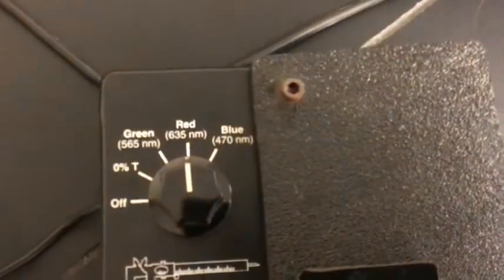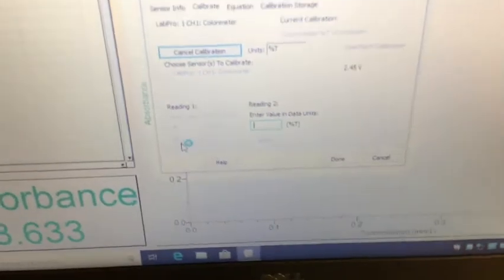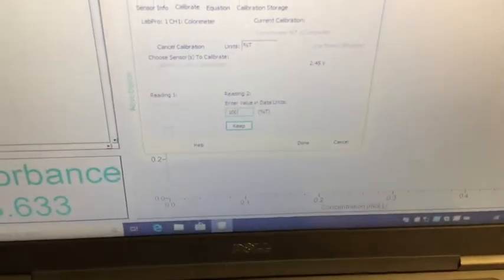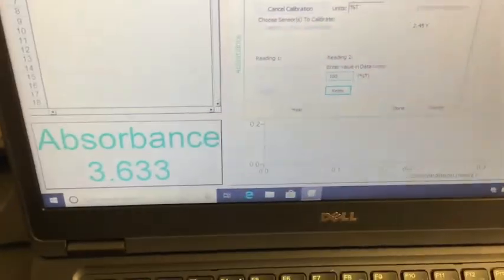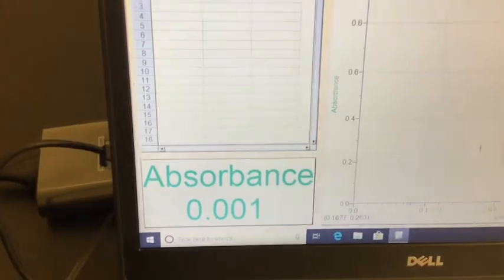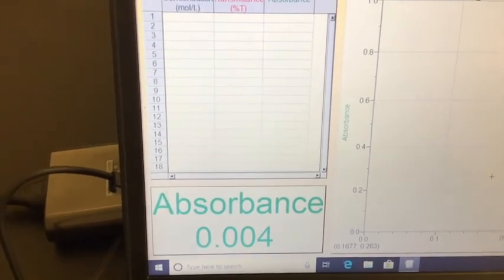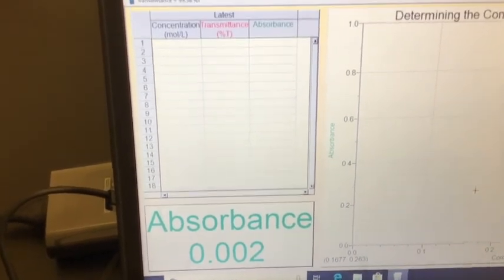Now that we're on red, we have 100% red light going through. All we have to do is tell the machine this is now 100. Type in 100 and click Keep. When we do, our absorbance should now read zero. Click Keep, then click Done. Our absorbance is now very close to zero — just a few thousandths of an absorbance unit, which is essentially nothing. This device is now zeroed out and calibrated.